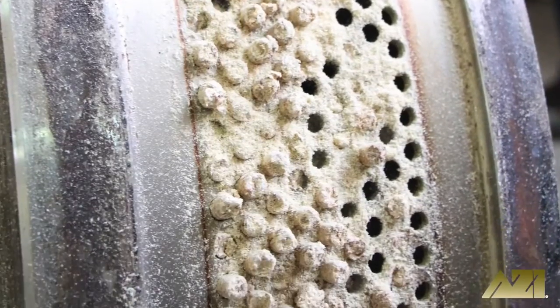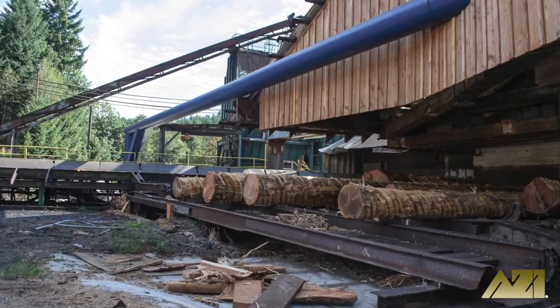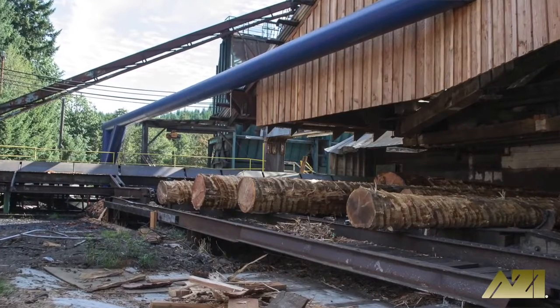For premium pellets like those used in this test, the bark has even been removed to create a more pure pellet.